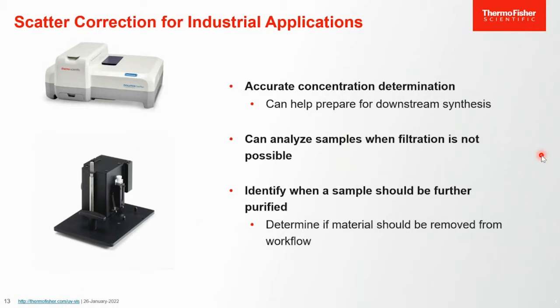And lastly, it can be highly useful when you're identifying a sample needs to be purified further down the line or needs to be removed entirely and restarted early on in the process rather than downstream when it becomes more difficult to remove that.